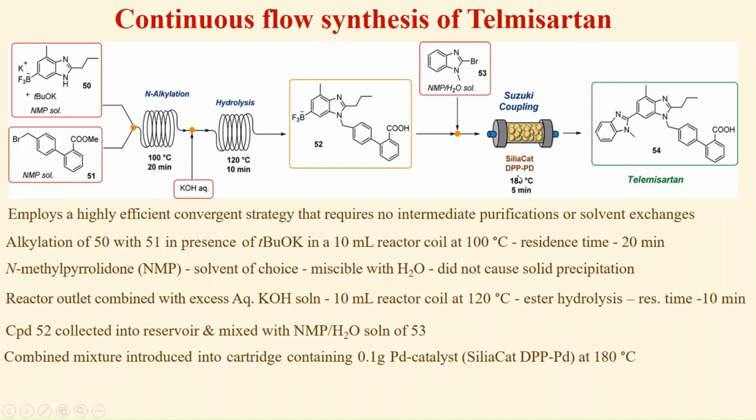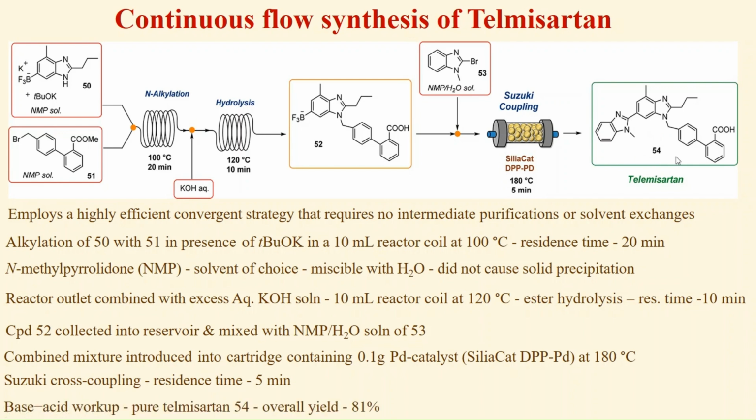This reactor is heated at 180 degrees centigrade, and the residence time was 5 minutes, and the Suzuki coupling occurred to give rise to telmisartan in quantitative yields, that is 81% yield was achieved after the acid-base workup.